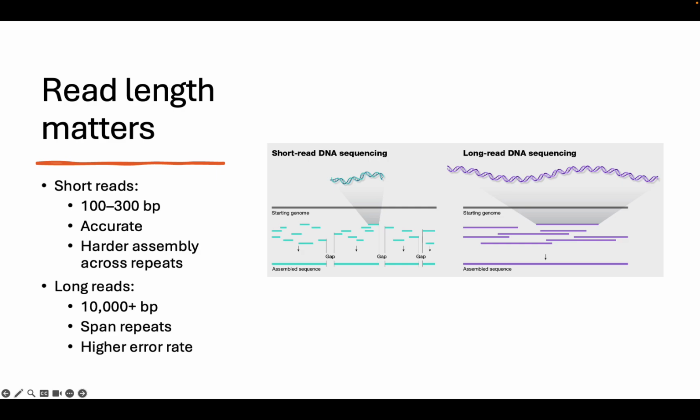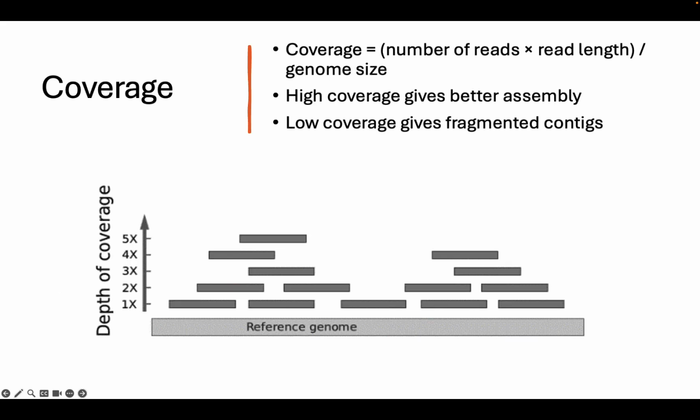Now, if I had better funding resources, if I had thousands of dollars to drop every time I wanted to do sequencing, I would 100% always do long read sequencing. And I used to say that I would only do Nanopore because I think Kevin is so cute, but I've been converted because of Jair. Those of you who know Jair, I've been converted to PacBio. So if I could afford it, I would do everything on PacBio. I can't afford it, so that's why I still do a lot of Illumina. And of course, when I do microbiome analysis, Illumina is fantastic. I don't need more than a couple hundred base pairs anyway, so why would I spend the money to do something more?